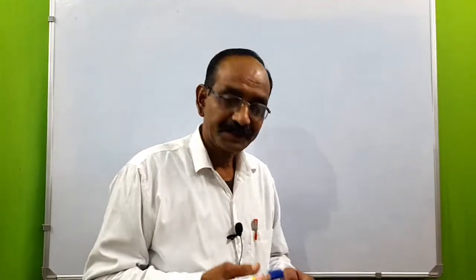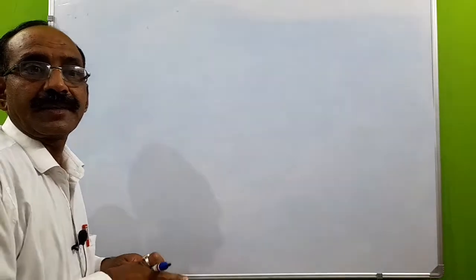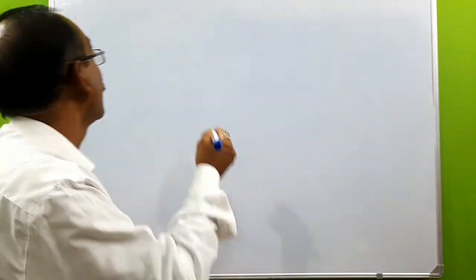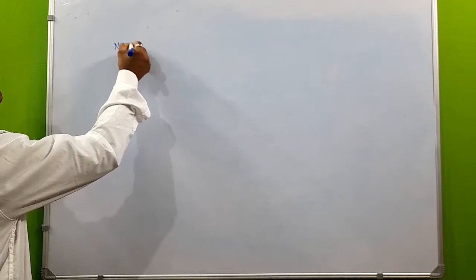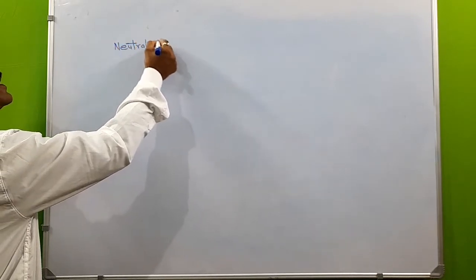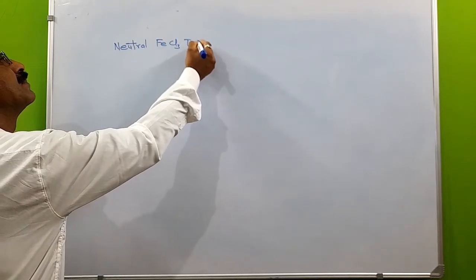Hello students. So today I'm going to discuss tests for phenols, and one of the tests is the neutral FeCl3 test.